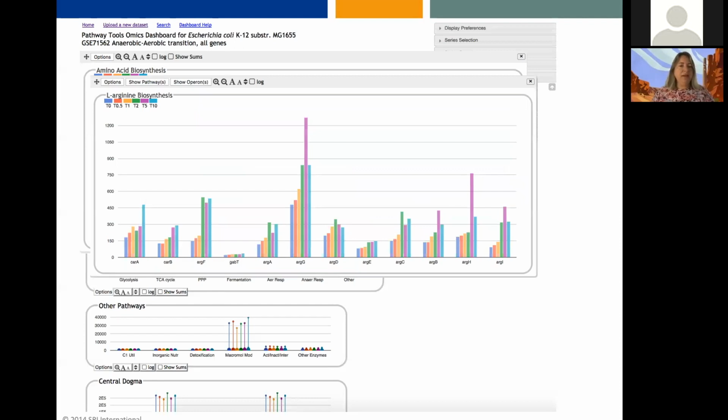So I click on that, and now I'm finally at the lowest level, where I'm looking at the level of the individual genes and seeing how they change. And different parts of different systems have different numbers of levels in the hierarchy. Some of them, there's only one level, and some of them there's more than two. This is a case with two levels, so it's nice for demo. But I can see, pretty much all of these genes are going up and then coming back down at the end. So that's useful. They're all behaving more or less the same way.